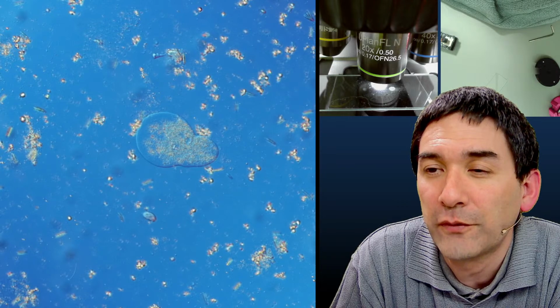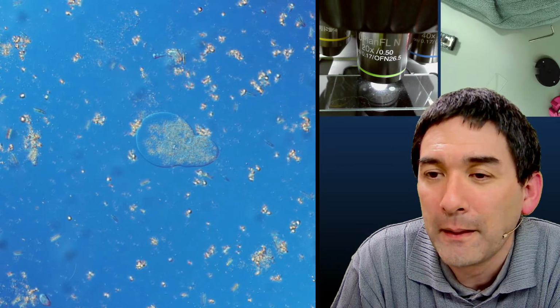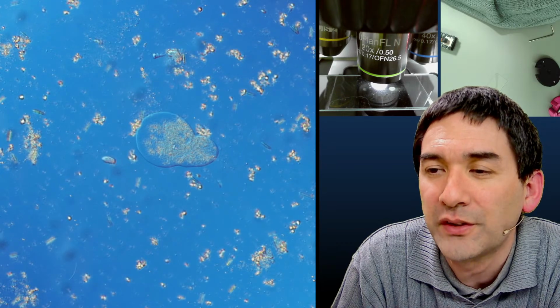Hello, I just got my first microscope this weekend, having a lot of fun looking at pond water. Yes. Yeah. I have made some great spore prints on foil paper before, so I hope the same effect will work directly on the slide.